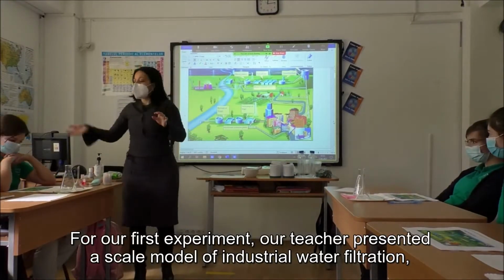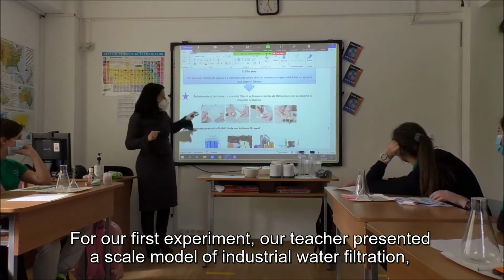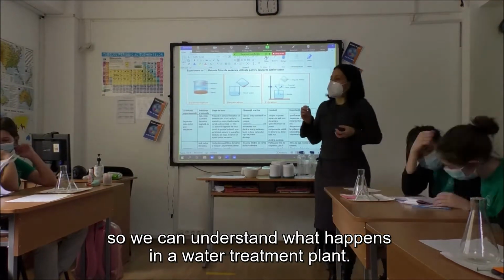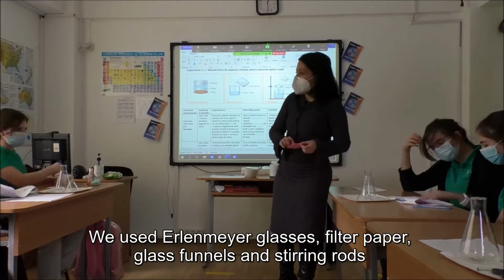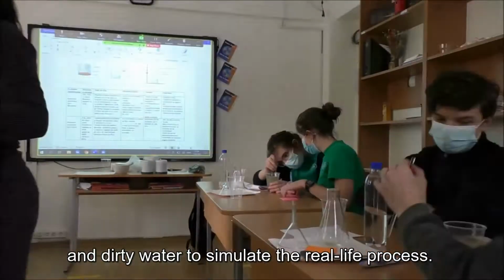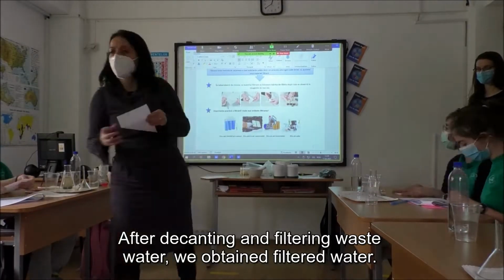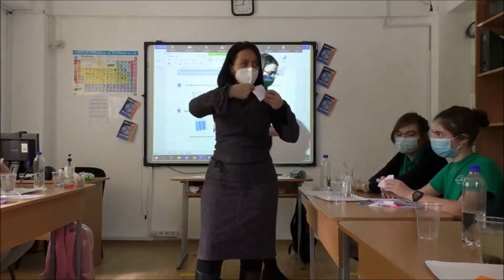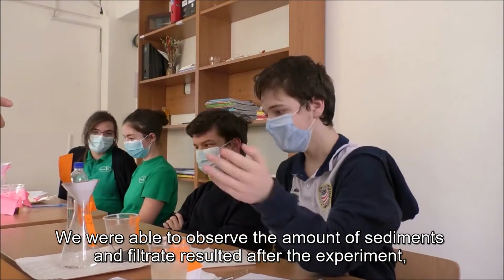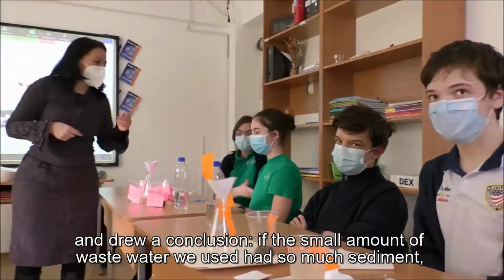For our first experiment, our teacher presented a scale model of industrial water filtration so we can understand what happens in a water treatment plant. We used Erlenmeyer glasses, filter paper, glass funnels, and stirring rods in dirty water to simulate the real-life process. After decanting and filtering wastewater, we obtained filtered water. We were able to observe the amount of sediments and filtrate resulted after the experiment and drew a conclusion.